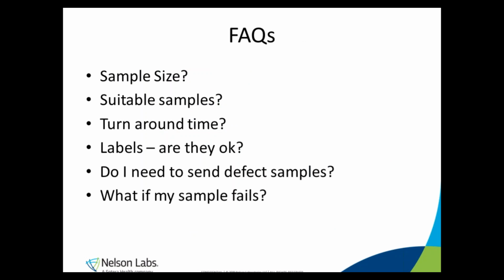So what are some of the most common questions that were asked about this test? Question number 1, how many samples do I test? Well, that's the question we get asked about almost all of our tests. The standard has no specific quantity to test. So that means it's left to each company to determine an appropriate sample size. This is usually done by a statistically based sampling plan based on a few factors such as risk and lot size. If you need any assistance with sample size justification, that's another relatively new service that our Nelson Technical Consulting team is offering. So you can contact them for help with that.